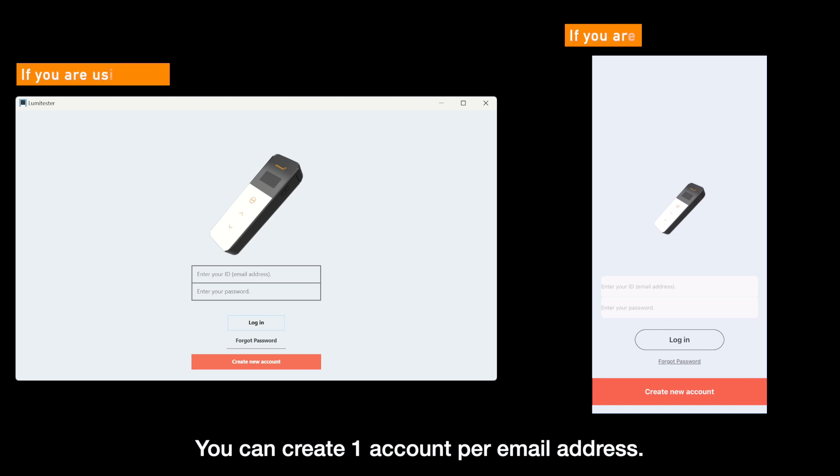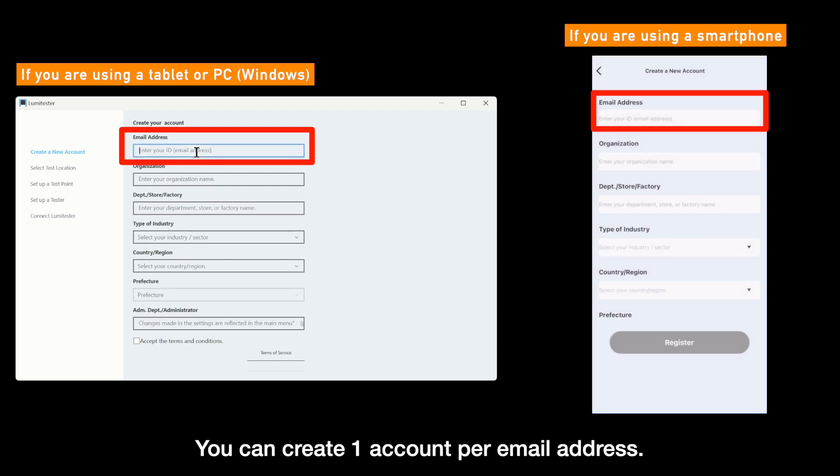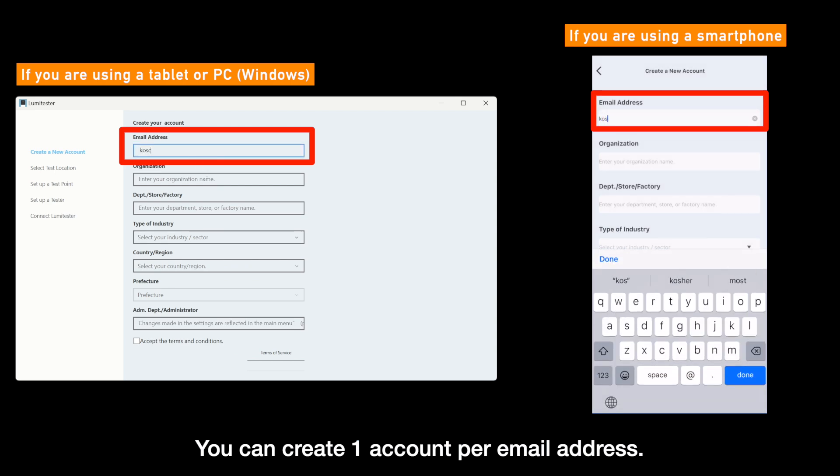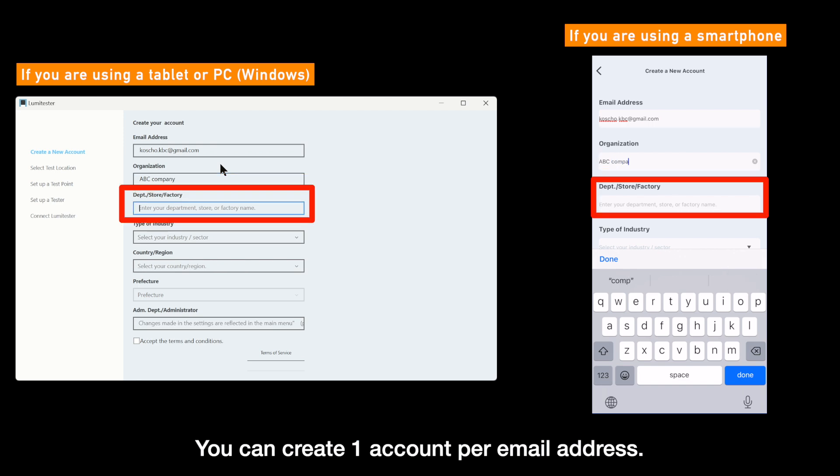After installing the app, please click or tap this button to register if you have not created your account. According to the screen, please enter your email address, organization name, department name, type of industry, and so on.